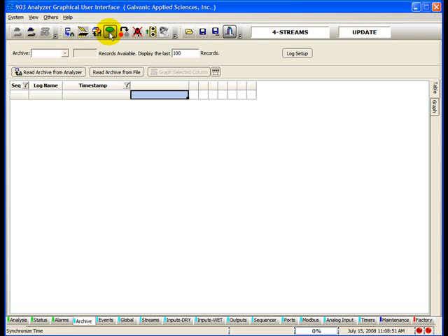Synchronized Time updates the onboard real-time clock in the 903 to the time and date set on the linked computer. Acknowledge all latches. Returns all latches that may have been triggered by alarms to their default configuration.